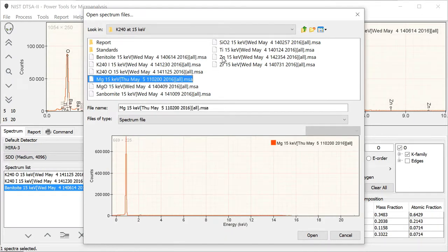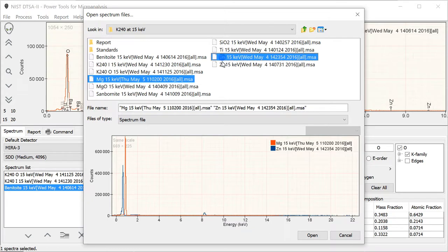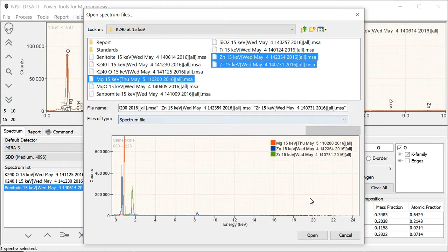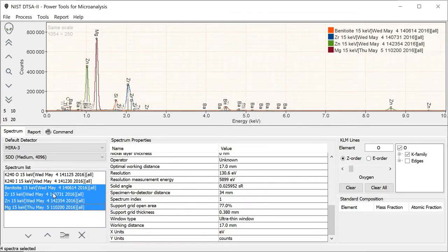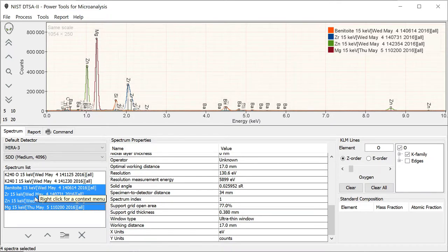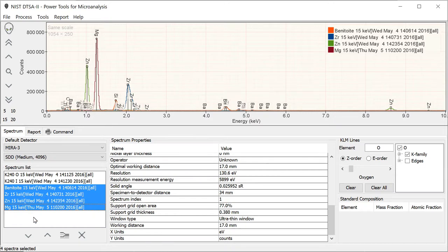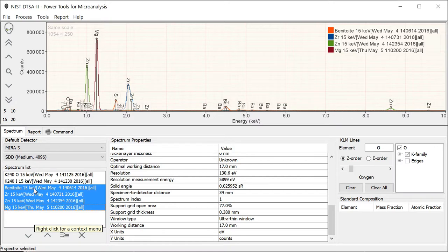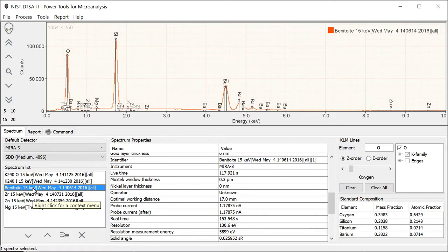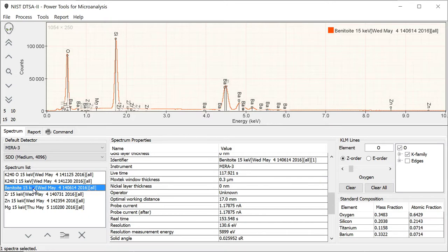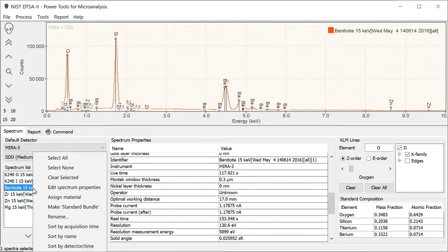We're going to use the magnesium, zinc, and zirconium as our other standards. That's providing barium, titanium, silicon, oxygen, zirconium, zinc, and magnesium. To make this easier, we're going to ensure that all the correct information is included that's needed to do this quantification in a single file. To do this, we are going to create what we call standard bundles.